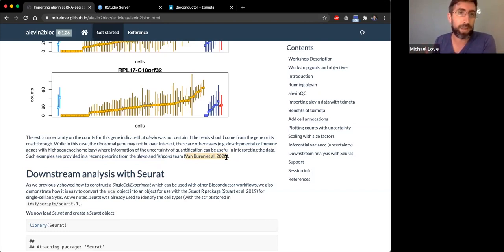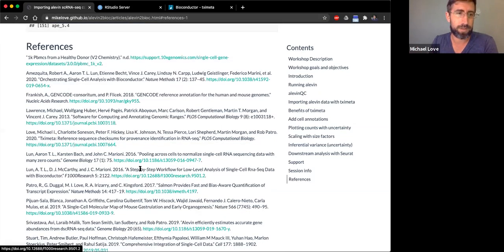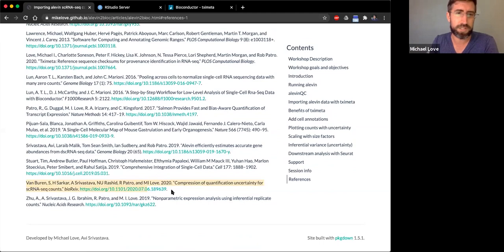We found that I think 20 gave the same good coverage as 100 bootstraps. So it seems like 20 is sufficient. And just storing the mean and variance was sufficient to get the same coverage. So that's this preprint down here, it just went up in July.